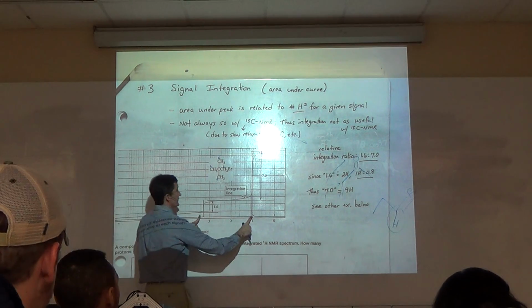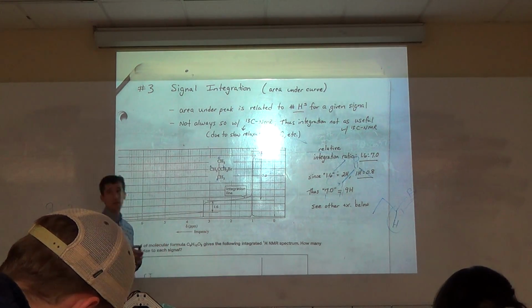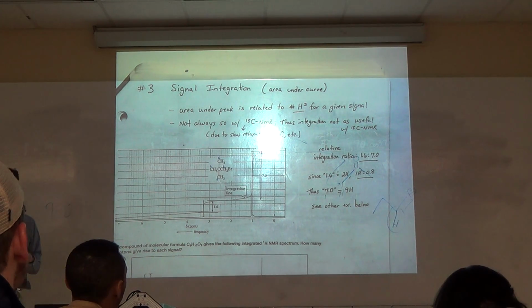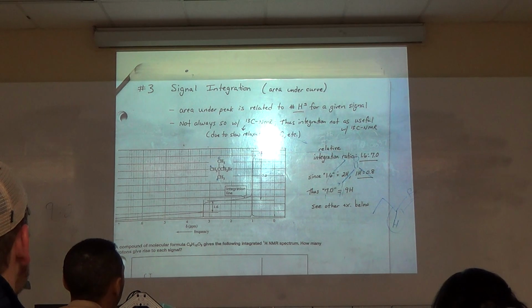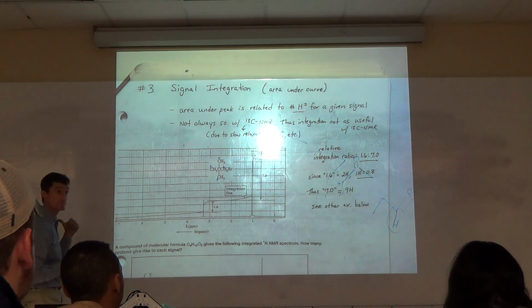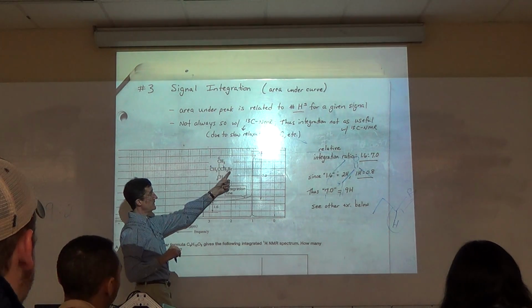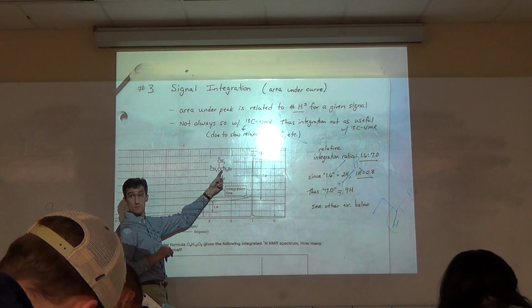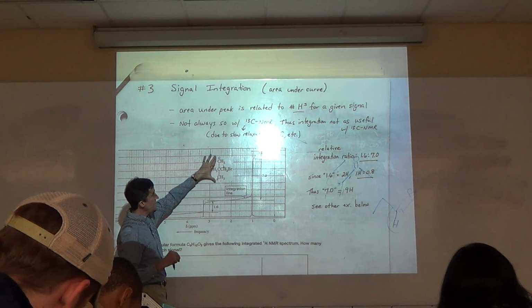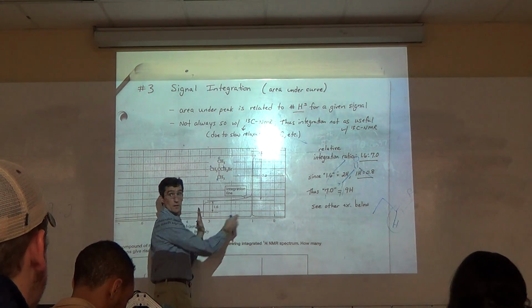Here are your 2 signals. Which one do you expect to be more downfield, A or B? Downfield is de-shielded, that's B. The one closer to the bromine, it acts as a de-shielder. What do we say when it's bonded to a bromine? About 3 to 4. You see how this is about 3 to 4? These others are more like plain alkane, so they're going to be closer to 1.